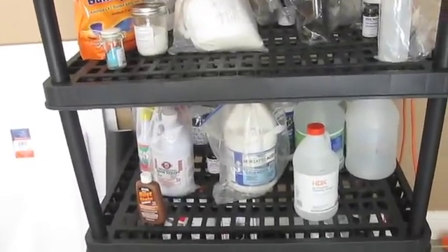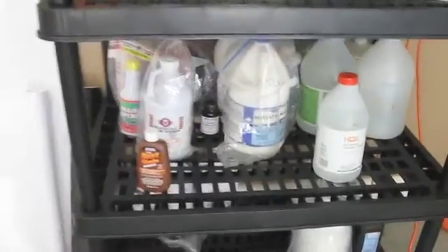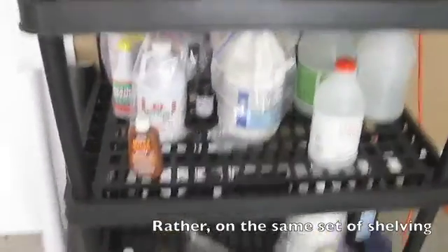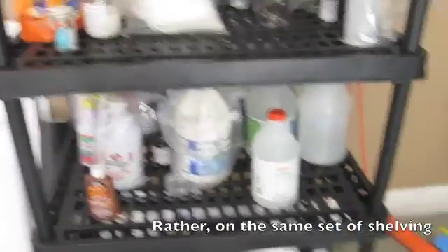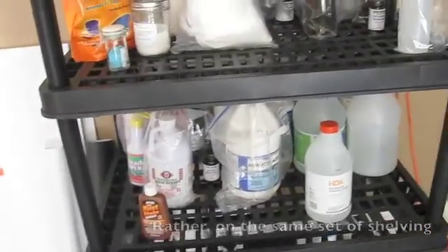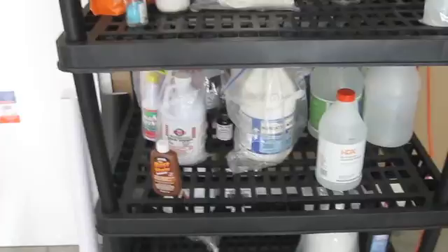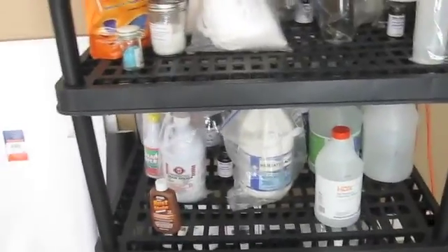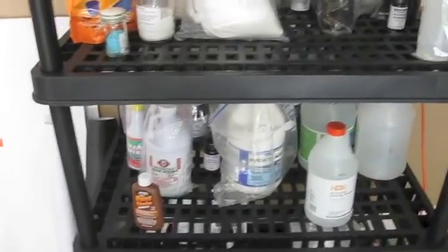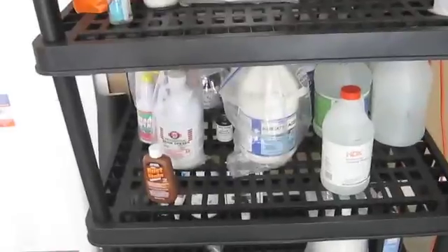It's also a good idea to store acids separate from oxidizers. Here I'm not doing a terribly good job of that because they're on the same shelf, but cardboard will help. Some hydrohalic acids — like hydrochloric acid, hydrobromic acid, and hydroiodic acid — can be oxidized by strong oxidizers like sodium or calcium hypochlorite to form their pure halogen counterparts, and you do not want a halogen floating around in your lab area. That would not be very fun.